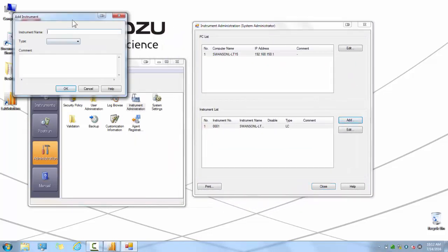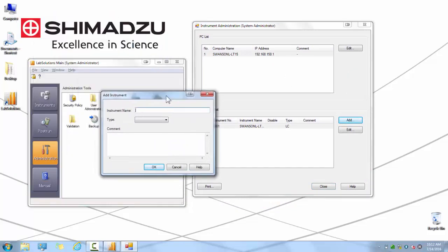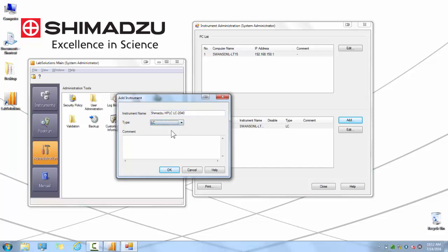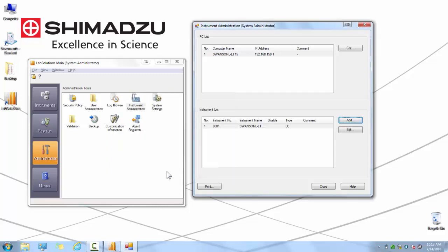Once the Add Instrument screen pops up, you can enter in a name of the instrument for your own reference. Select the type of instrument from the drop-down menu, either an LC or a GC, and then you can enter any comments in the fields below, such as a system description of the modules used, the purpose of the instrument or the location of the instrument. Once you have entered in all the information you desire, click OK, then click Close on the instrument administration screen.